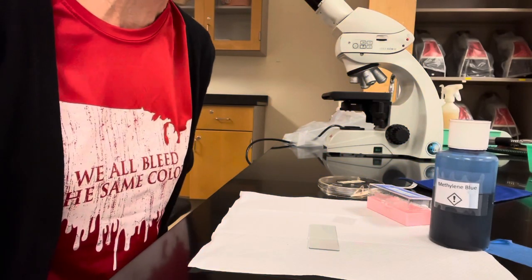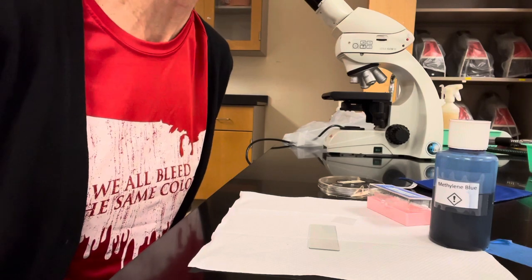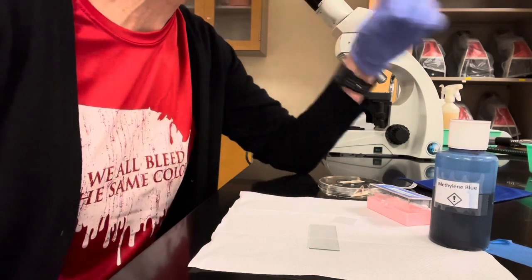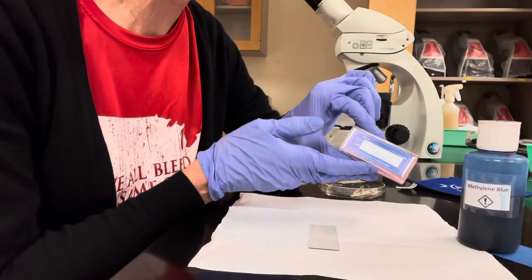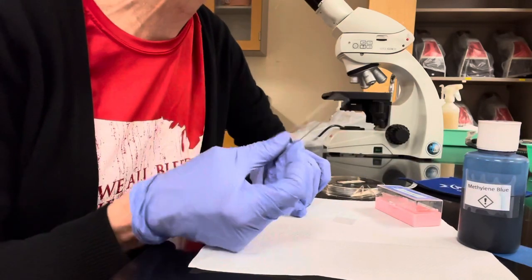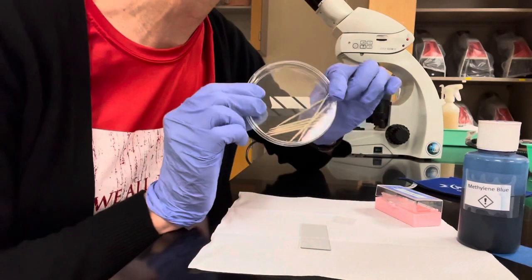Today I'm going to show you how to do a wet mount using cheek cells from the inside of your mouth. So from your kit, go ahead and get out the methylene blue. Find your box of cover slips. You're only going to need one. Get a clean slide. And then you're going to need to find the sterile toothpicks.